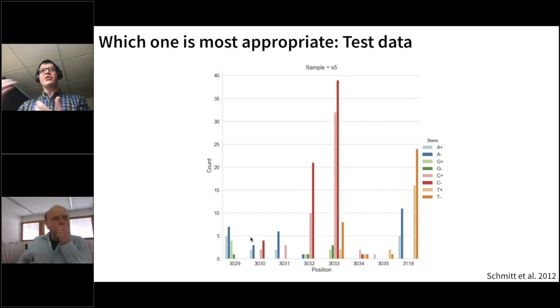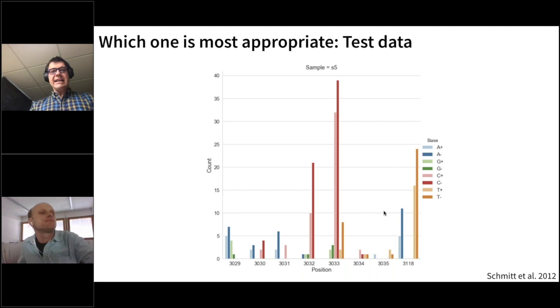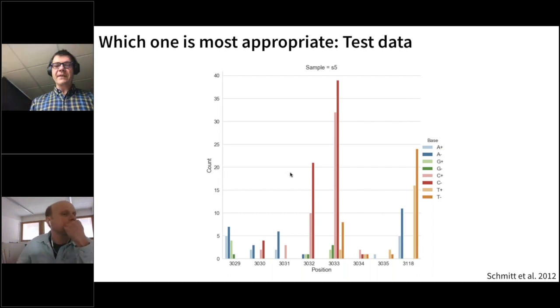It's not like you have G to A, you can have G to T or G to C, you have multiple variants. And these are their counts. These are not frequencies, this is absolute counts. And you can see that these counts are low. So these are variants at low frequencies. And we consider this a true set because we know these frequencies from duplex sequencing data.